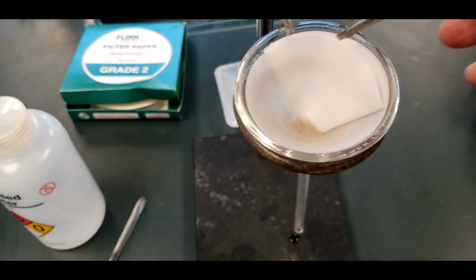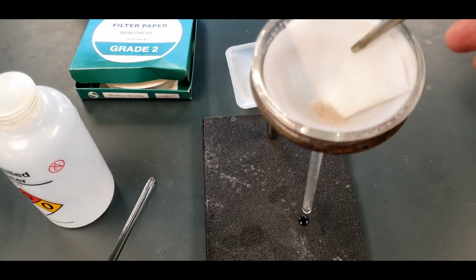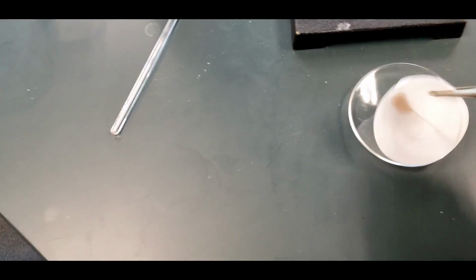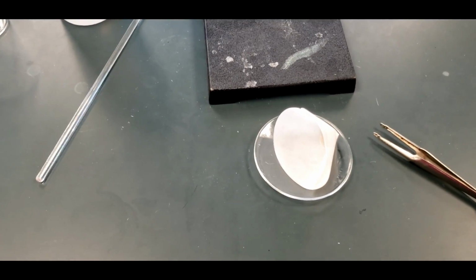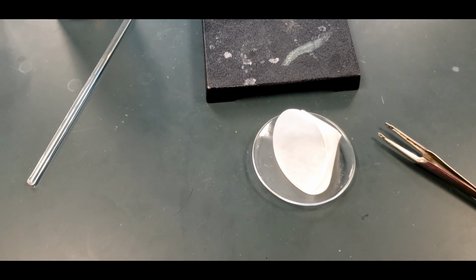All right, we're going to take the moist sand that's in the filter paper. The filter paper is also wet. Put that here, and oops, because I'm holding this camera with one hand, I'm going to open this up, and then I'll show you putting it into the oven.